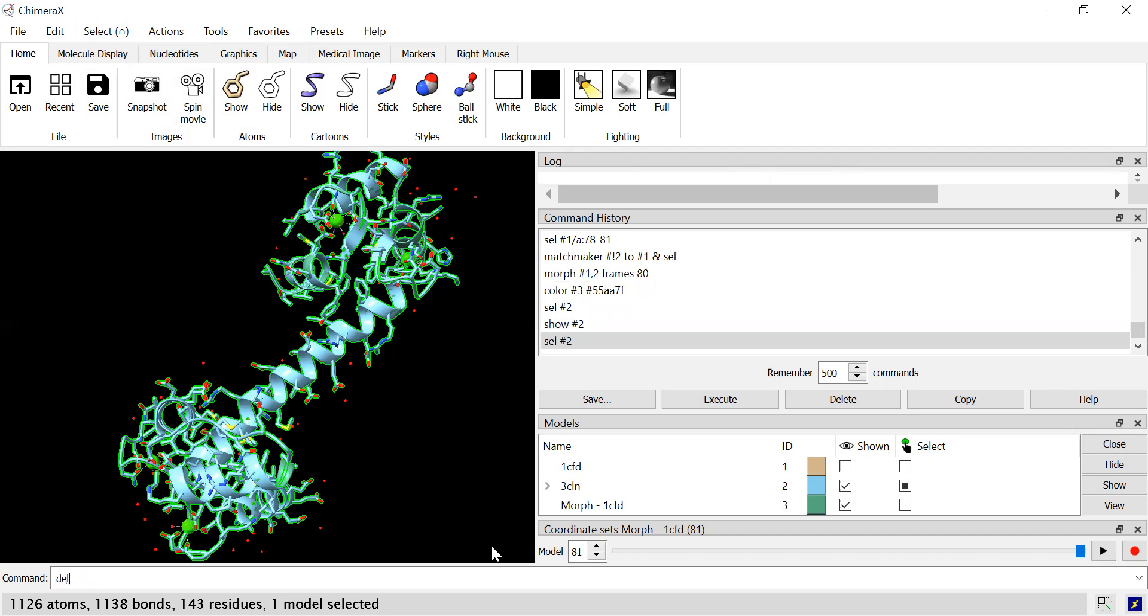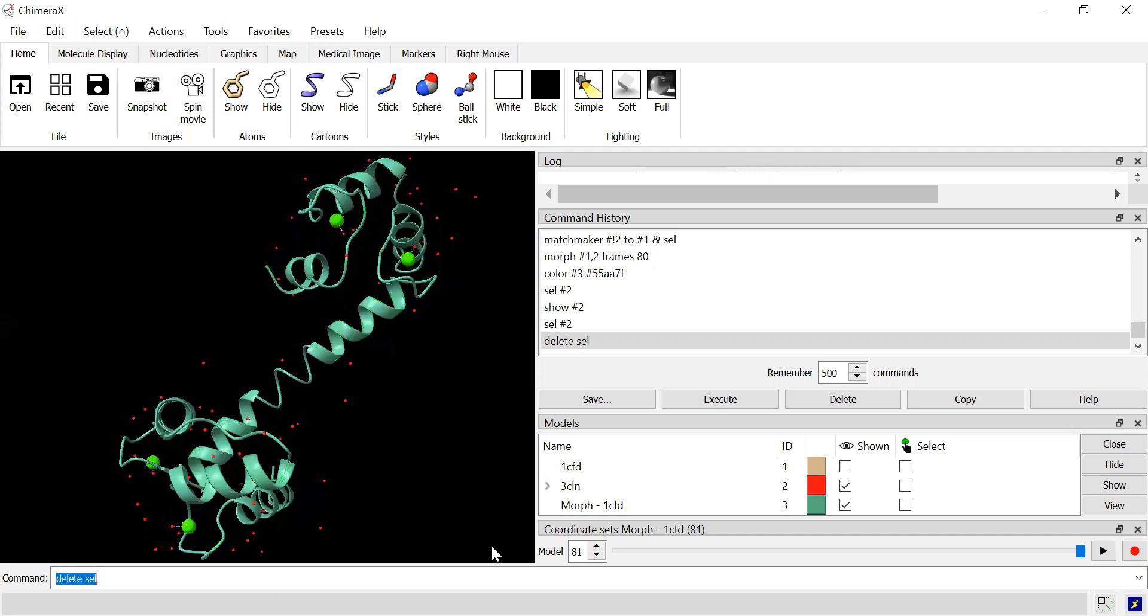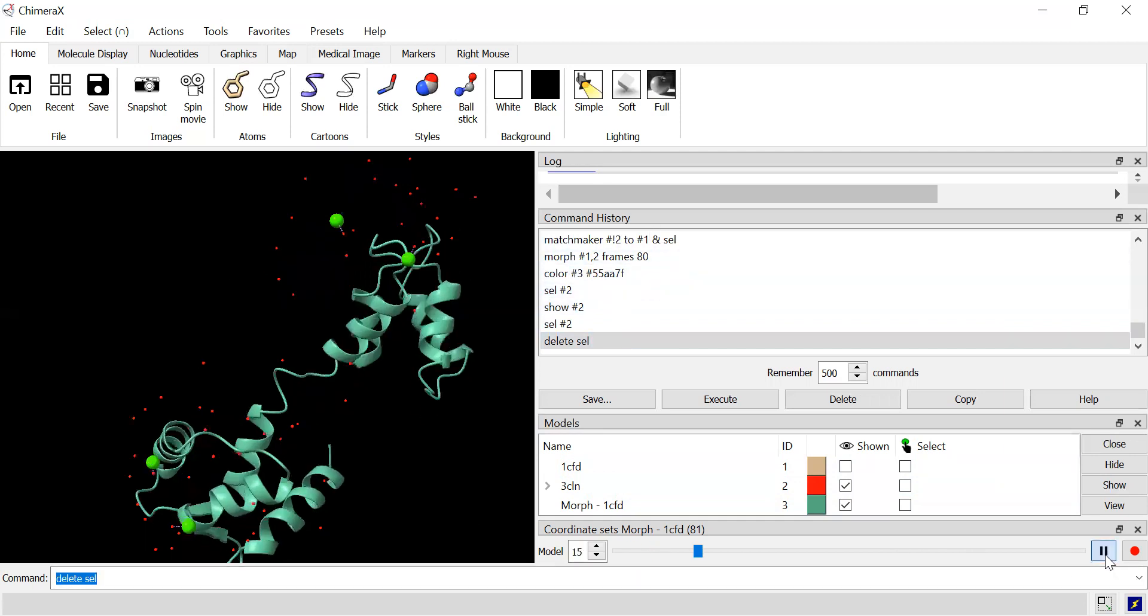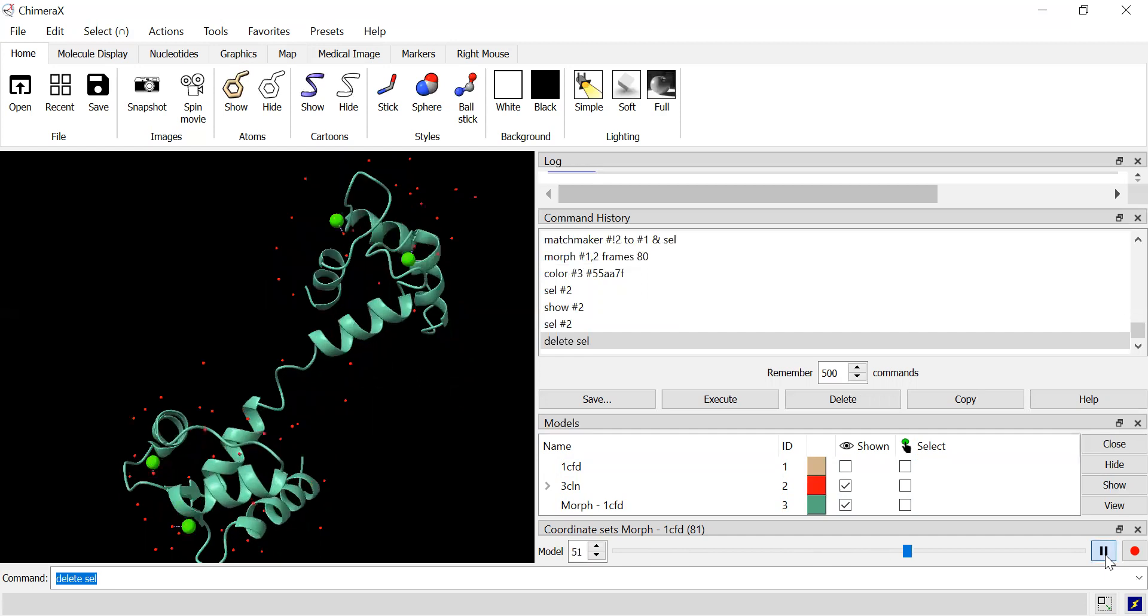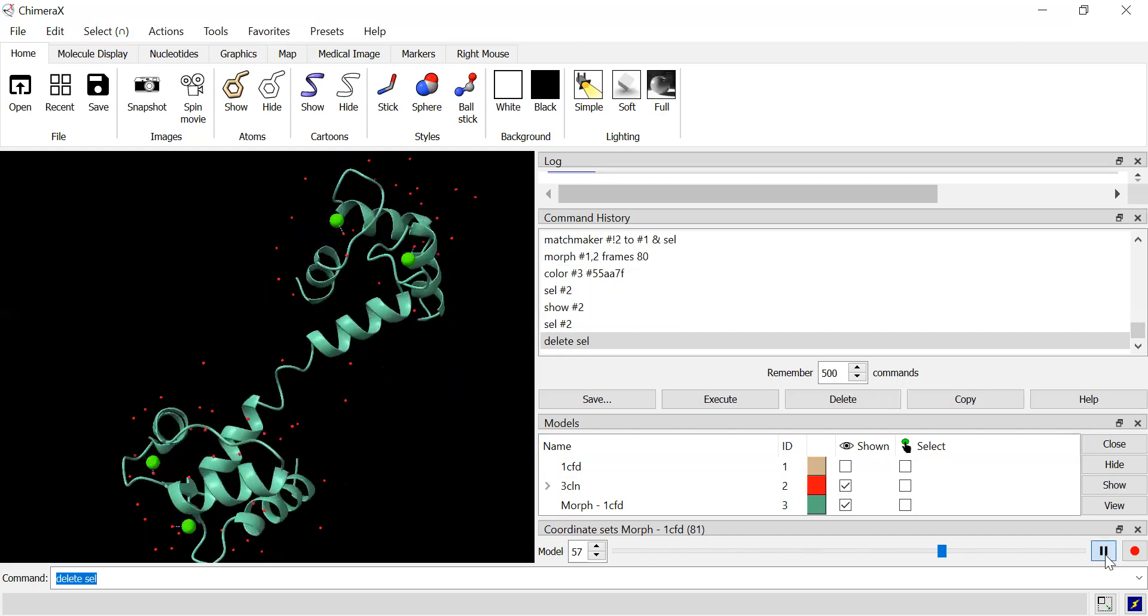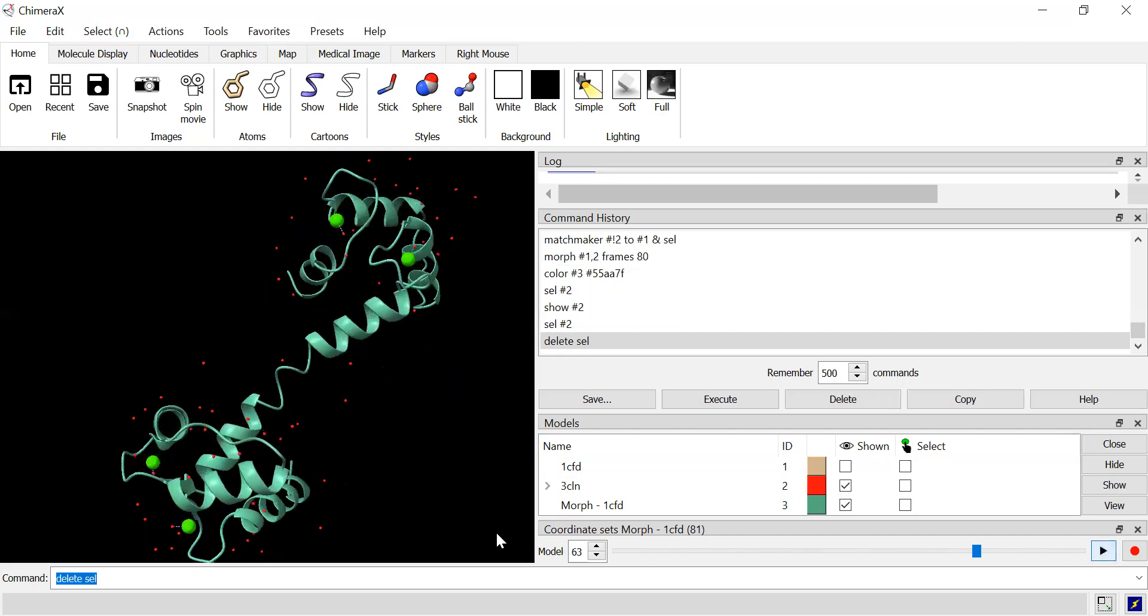And then if you want to delete your selection, now you've deleted all the protein in number two right here. Obviously, we still have these waters flipping around, which you wouldn't do if you follow this other command line. But I'm kind of showing you how it's important. Then when you do this, you can see it morphing around the ligands. It's very nice.